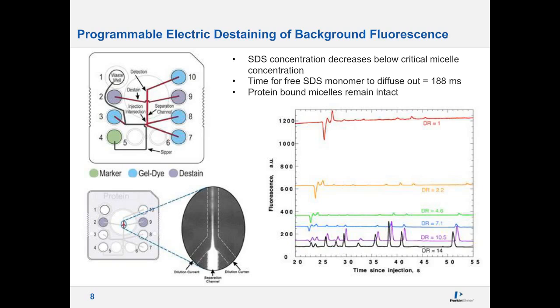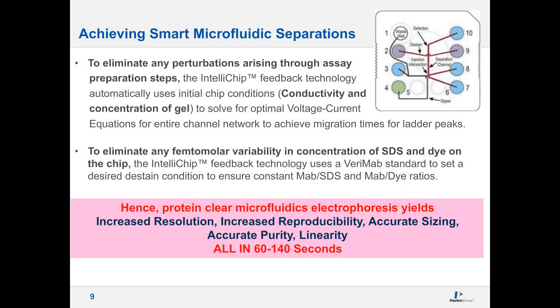This is shown in our experiments: when there is no de-stain, you can hardly see any peaks because the background is very high — around 1200. But as you keep applying more de-stain current and the de-stain ratio (DR) becomes higher, at a de-stain ratio of 14 you start seeing more peaks. This is the key innovation in this chip — you can dynamically create de-staining of the protein. There is no membrane, manual washing, or any manual steps; this is all automated. We can see the peaks and move towards resolving these proteins.